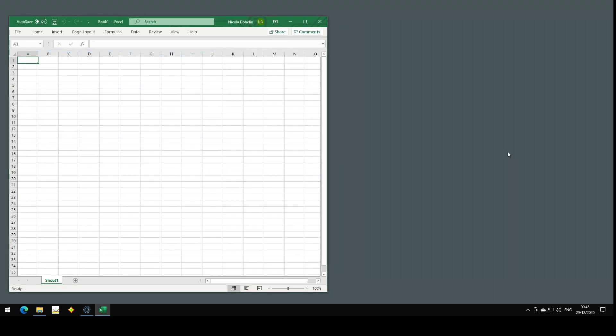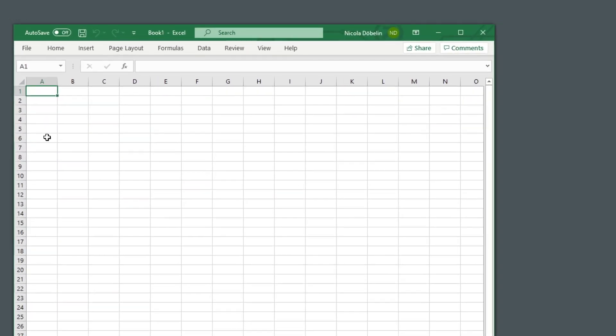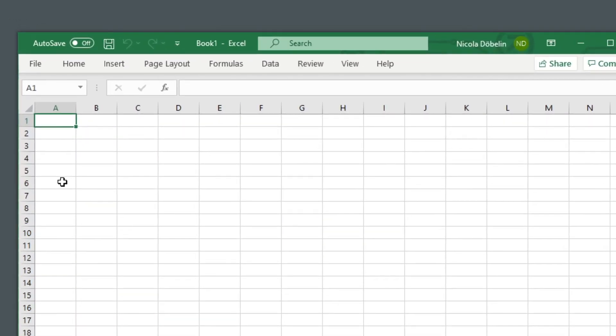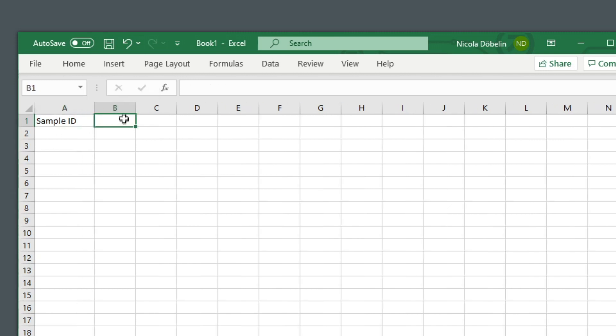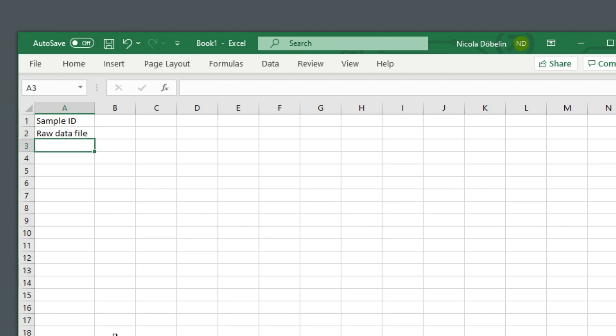We start with an empty Excel spreadsheet like this one, and let's say we want to display the sample ID in the first row. So this is the header, and I want Profex to write the sample ID to cell B1. And we can also add the raw data file here.